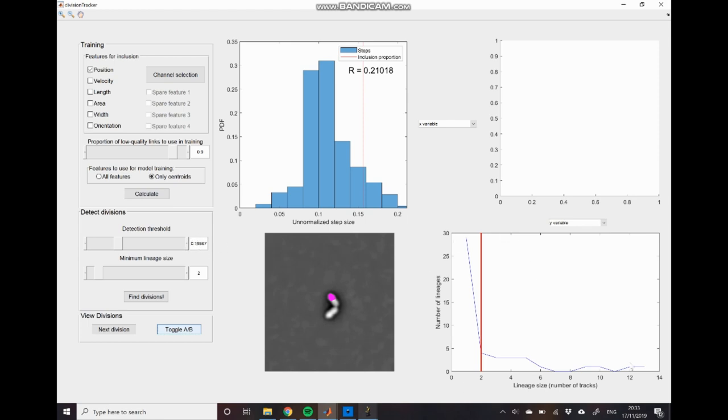We can also look at this which is the lineage distribution. This tells us the number of lineages that are of a particular size so how many tracks are within each lineage and you can see at the moment that the majority of our lineages contain a single track. So this is telling us that again we probably have too stringent threshold at the moment.